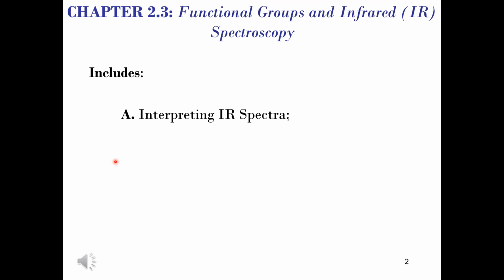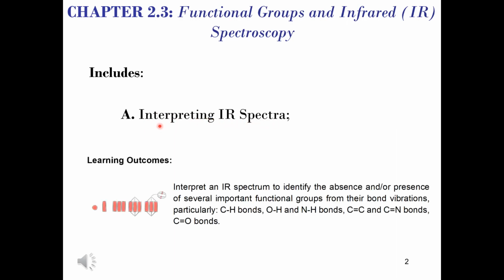So now that you understand the physical basis of IR spectroscopy, we'll be paying particular attention to the bond vibrations that are highlighted in the learning outcome. You're more than welcome to pause the video and read these, and as usual they can be found in your handout. This slide will move on after 5 seconds.